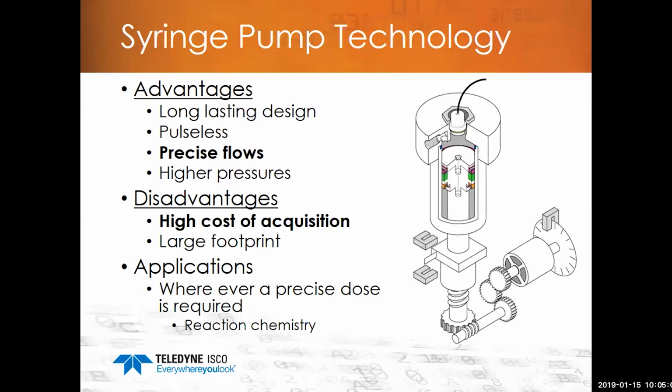Everybody's kind of gotten their flu shot or allergy shot. You draw back the cylinder, push the fluid back out. That's a very basic concept of syringe pump technology. Some of the advantages: it's a long-lasting design. This design has existed for years, and it's very precise. That's the key thing to think about.